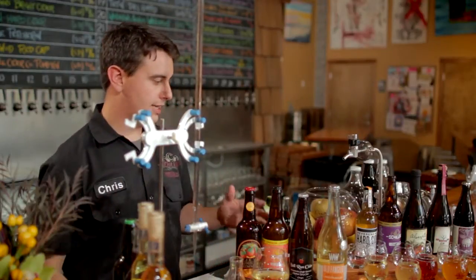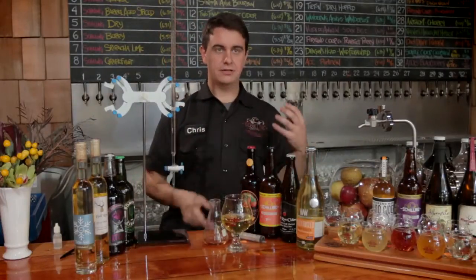Some of our items are more like 0.35%, and some of the very tart ciders are more like 1%. That matches with the relatively restrained sugar in there — it's on the drier side with just enough acid to balance it, but not enough to be over the top or biting on the palate. Between the BRIX and titratable acid of the Two Towns Bright Cider, you can see they've done a great job of balancing that cider, keeping it interesting and also drinkable.